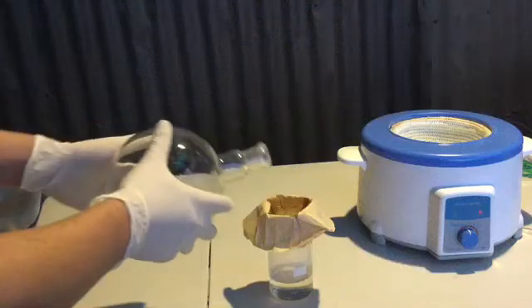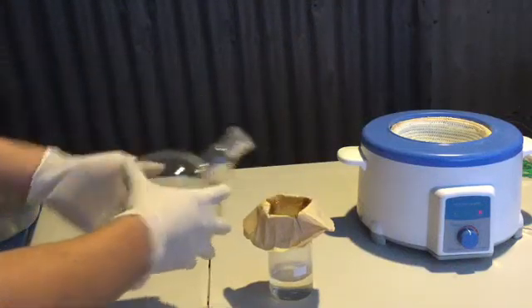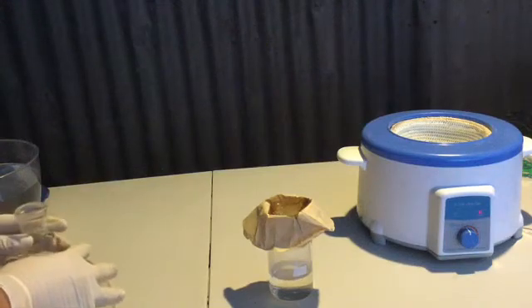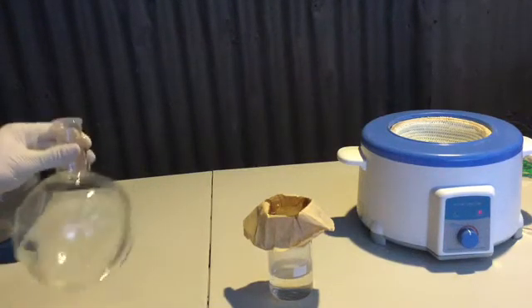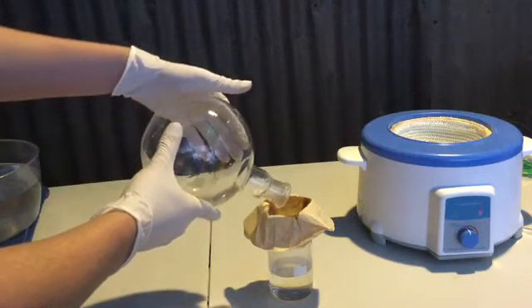After the solution was completely poured into the beaker, the flask was allowed to rest and the beaker was allowed to cool to room temperature. Whilst the beaker was cooling, an interesting observation was made about the boiling flask. I will skip the rest of the pouring into the beaker because it is pretty straightforward.